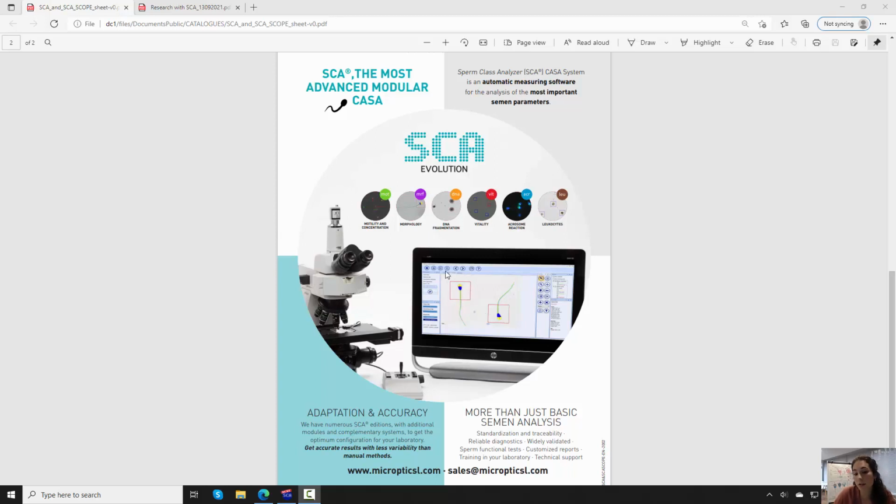It's also possible to check the minimum requirements that these three hardware components need to accomplish, and maybe some components that you already have in your laboratory can accomplish these requirements and you can use them.